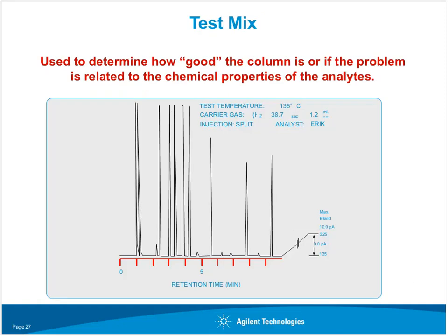So this is the chromatogram you get with a brand new column. This is the chromatogram for what you would get in the box, and you can actually see we go through great pains to make sure every column is tested. And also on many of the columns, we actually have the bleed specification mentioned on the column.